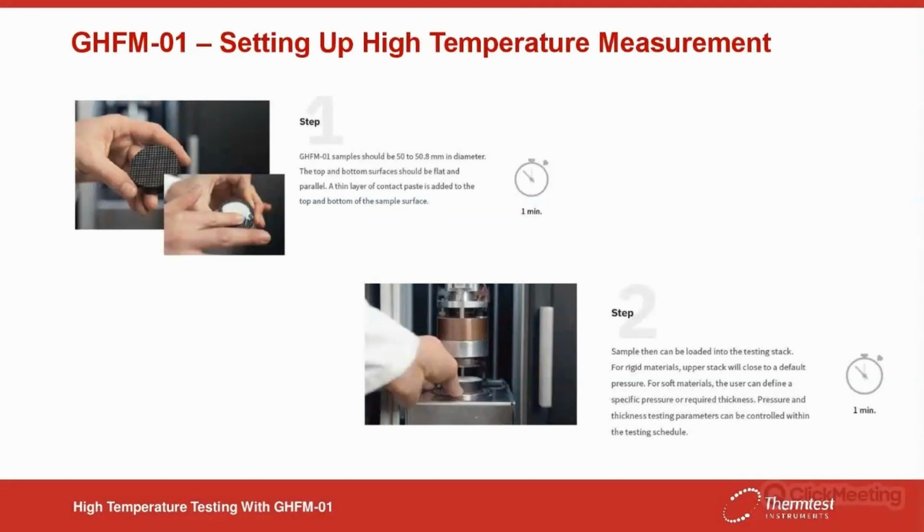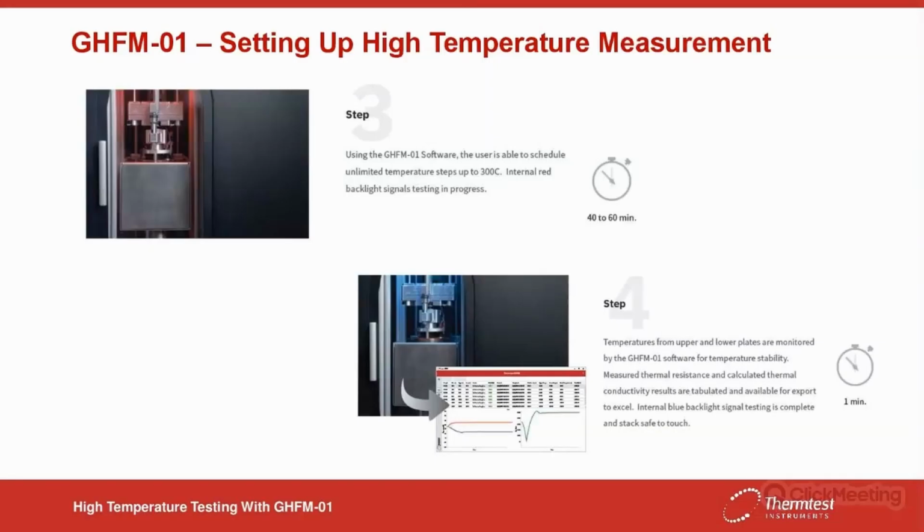Then you would apply the paste, introduce it to the stack. The stack would automatically close. And then you can start your schedule and run your temperatures.